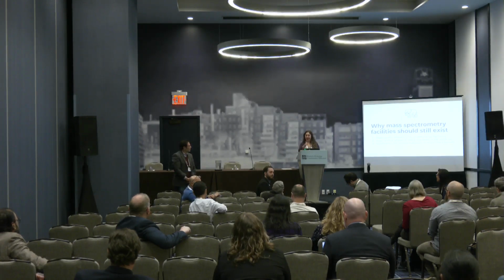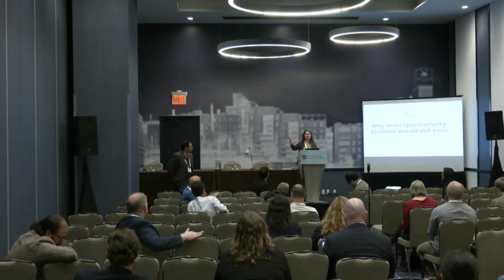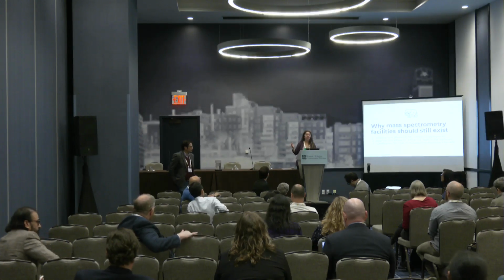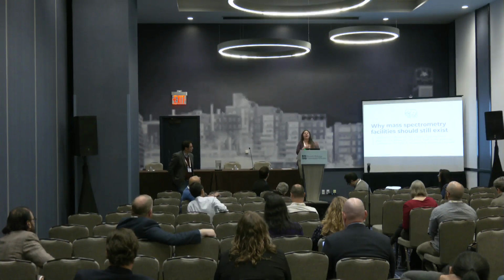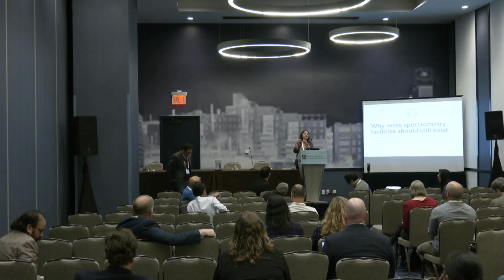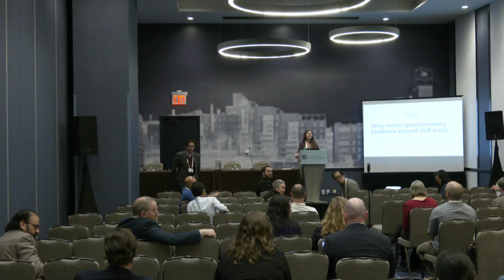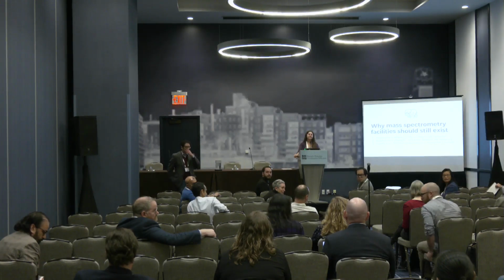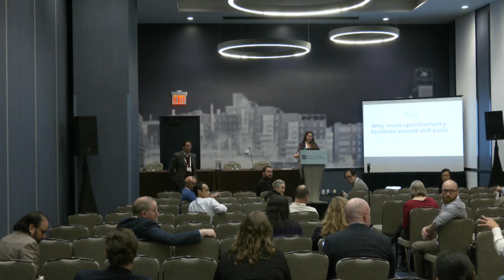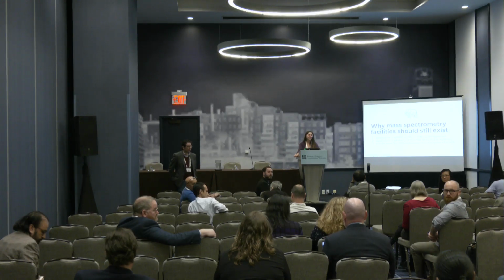I agree with that standpoint, right? Where mass spectrometry is part of this potentially much, much larger proteomics core, where we have other offerings. They might be in-house or they might be outsourced, and you have one of these proteomics directors that helps connect people with your strategic partner, someone who understands the pros and cons and matches them up against the correct services, regardless of whether it's the mass spec team, non-mass spec team, or teams, or as a liaison to an external CRO.